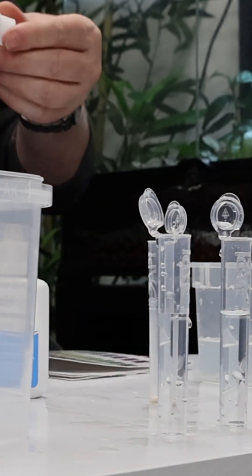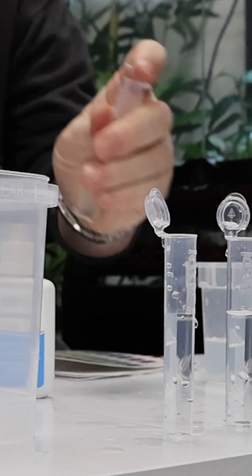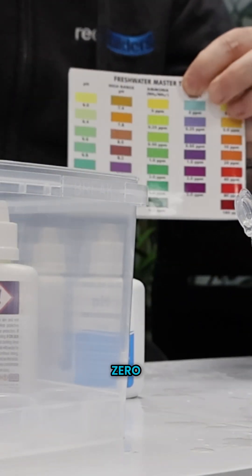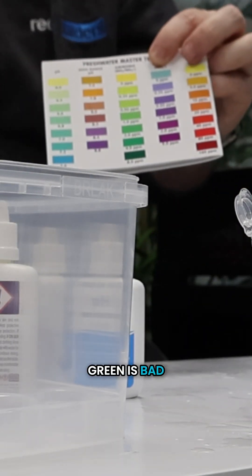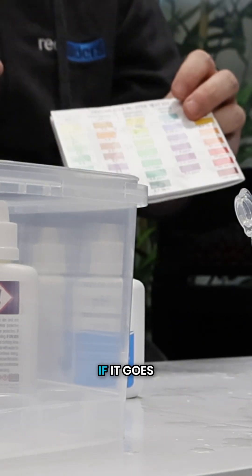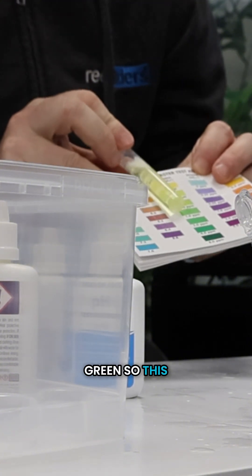Seven, eight. Give it a shake. And on our color chart, yellow is good—zero. Green is bad, green is very toxic and we'd have to take action to save our fish if it goes green. So this is good.